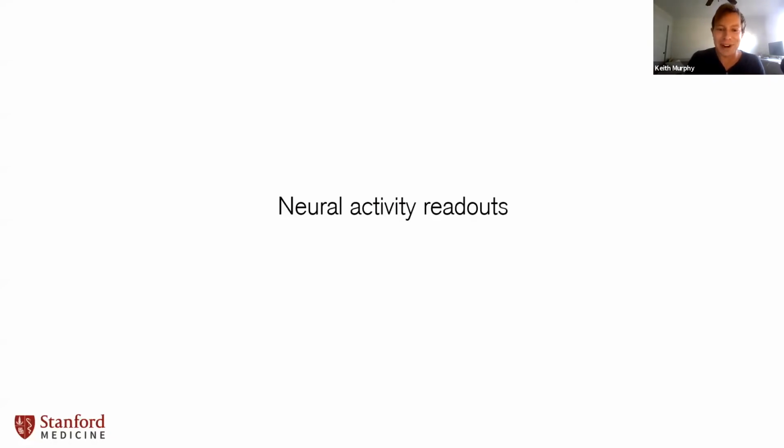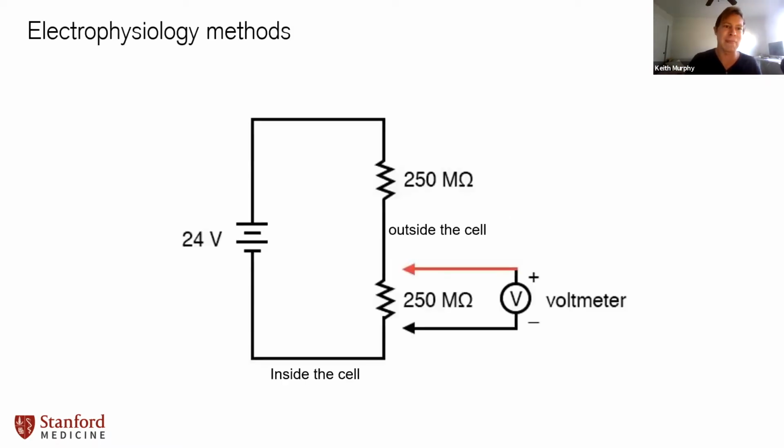Okay, so let's move on to different neural activity readouts. So you got a sense of easy tracking behaviors. Of course, there are many more. You can look at individual limbs. You can look at preferences for taste and things like that. But what if you want to record the neurons directly so that you're really asking right from the source, what's going on when I deliver ultrasound here?